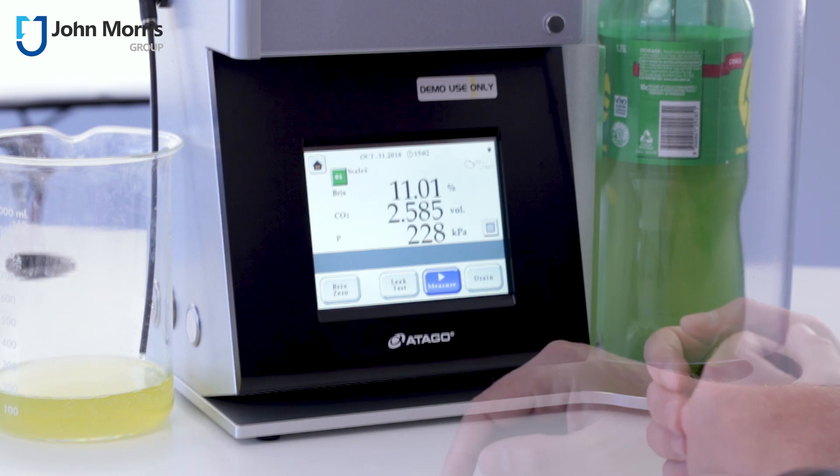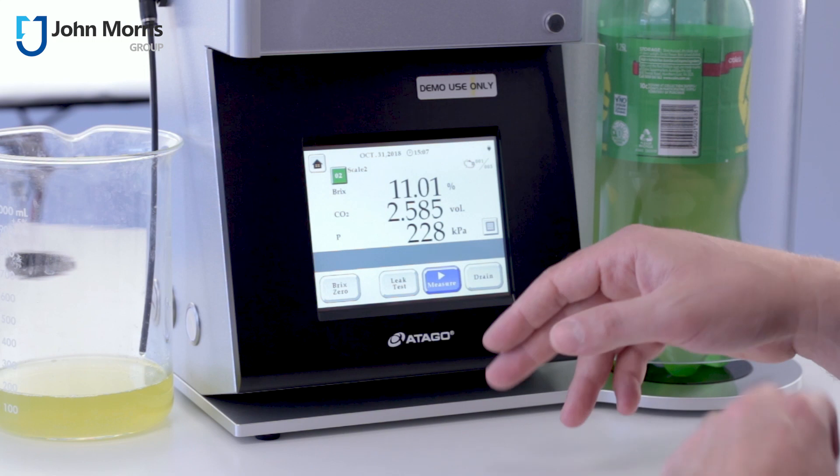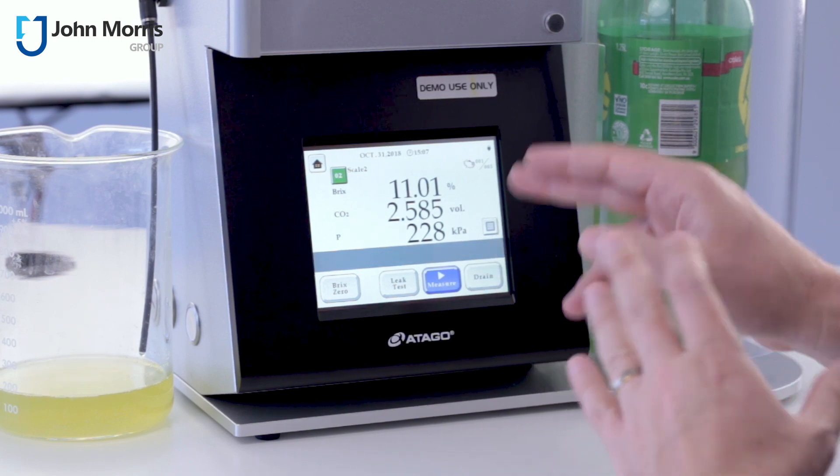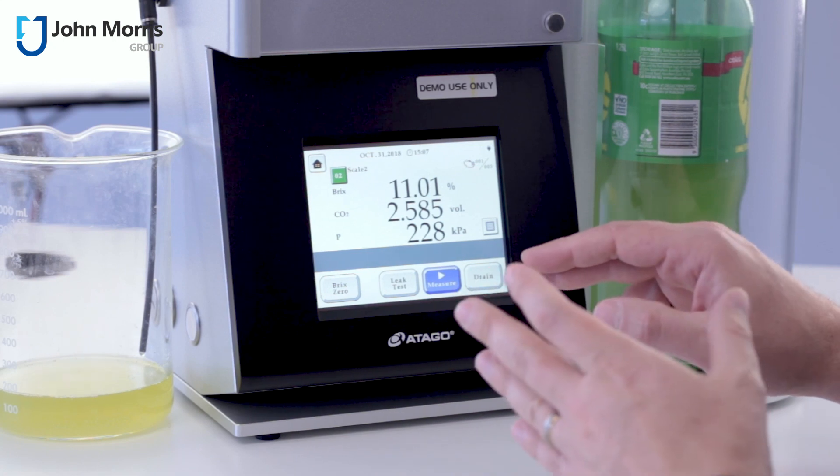And there you go. As you can see here, we've got about 11.01% Brix, 2.585 volume of CO2, and a pressure of about 228 kilopascals.